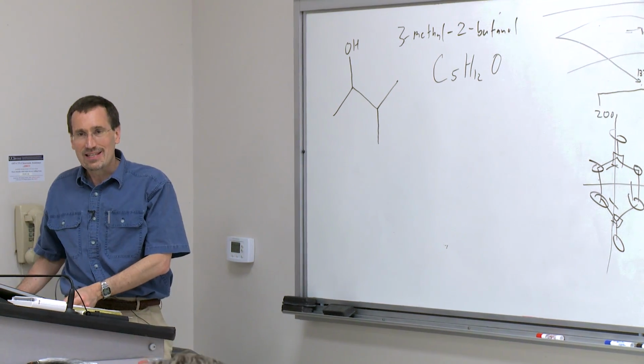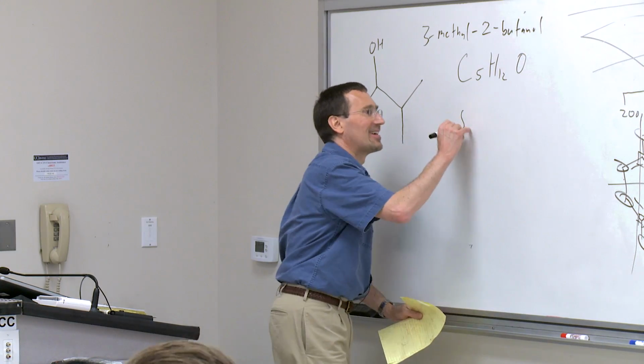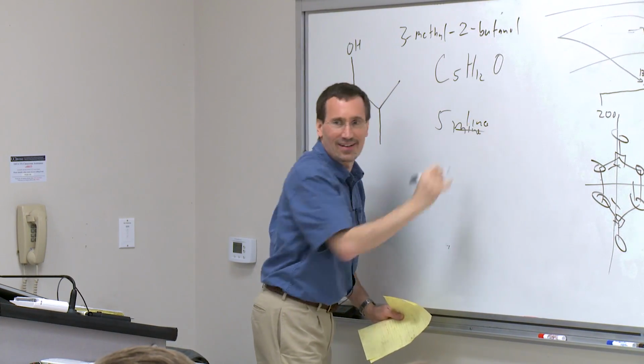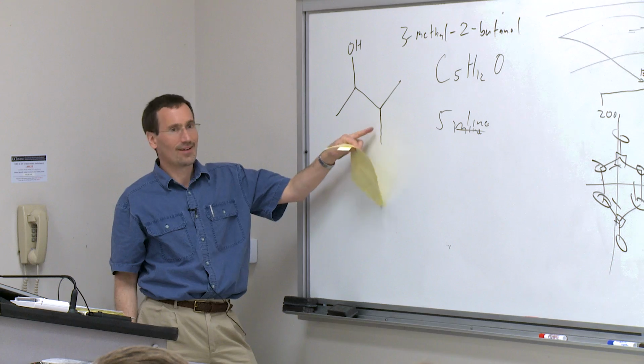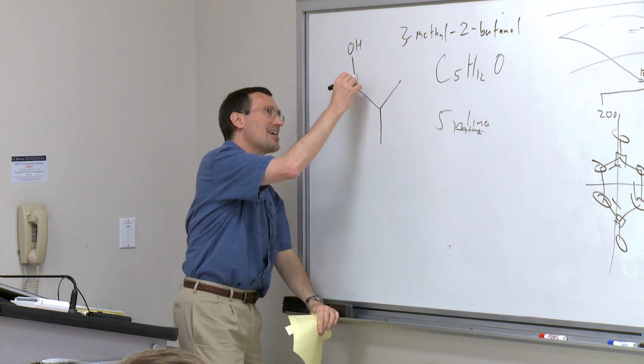How many lines? 5. Give it to me. Why 5? Oh, because those carbons would not be the same because of that stereocenter. Hey, you got it.